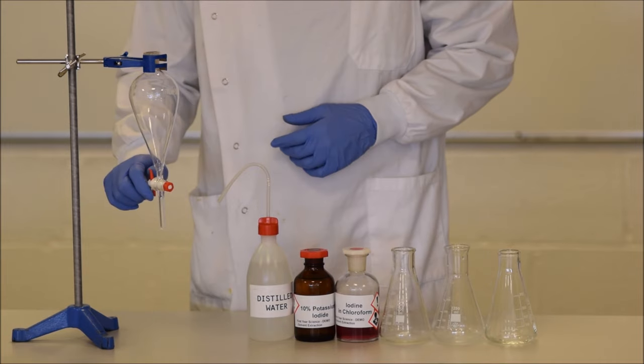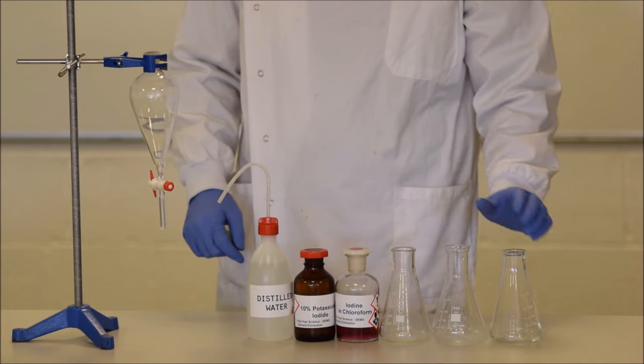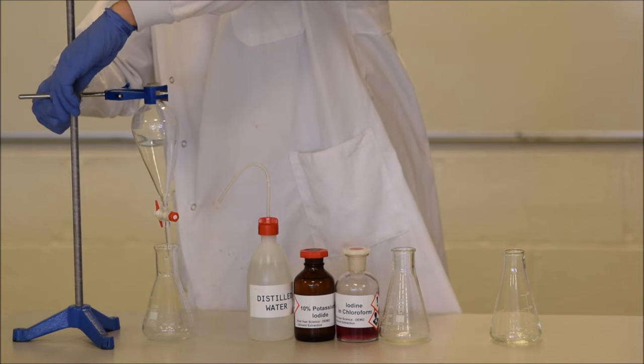Okay, now I'm going to demonstrate using one. So, two things to start off. Check that the stopcock is working and put a conical flask in place underneath the funnel. Lower it down a little bit to make sure that it's not going to splash as the liquid comes down.